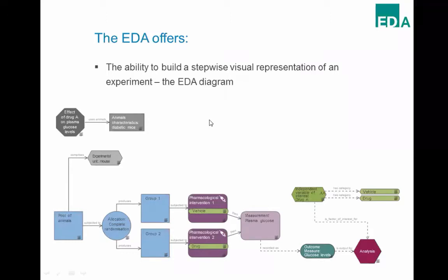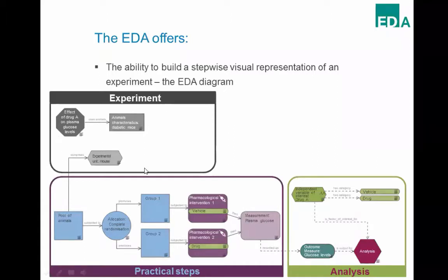In the EDA, every experiment is represented by one of these diagrams, which are in three parts. The grey nodes provide high-level information about the experiment: hypothesis, effect of interest, animal characteristics, experimental units, and so on. The blue and purple nodes provide information about the practical steps in the lab — groups, interventions, measurements, and so on. The green and pink nodes are about the analysis and the variables included in the analysis.